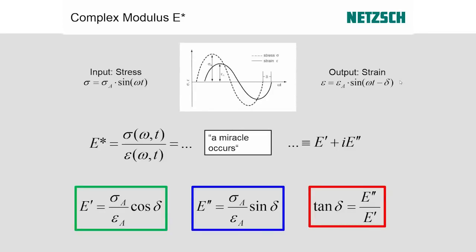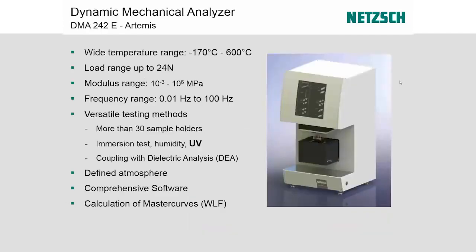So we get through some mathematical miracles. Again, same idea here. We have a separate presentation specifically on DMA, but suffice to say that you can get a loss modulus, a storage modulus, and this tan delta. The tan delta represents a damping factor, energy dissipation. That storage modulus represents our stiffness. So that's what we're going to follow, because going forward, when you're designing a part, often what you really need to get is the stiffness parameter for that particular material.